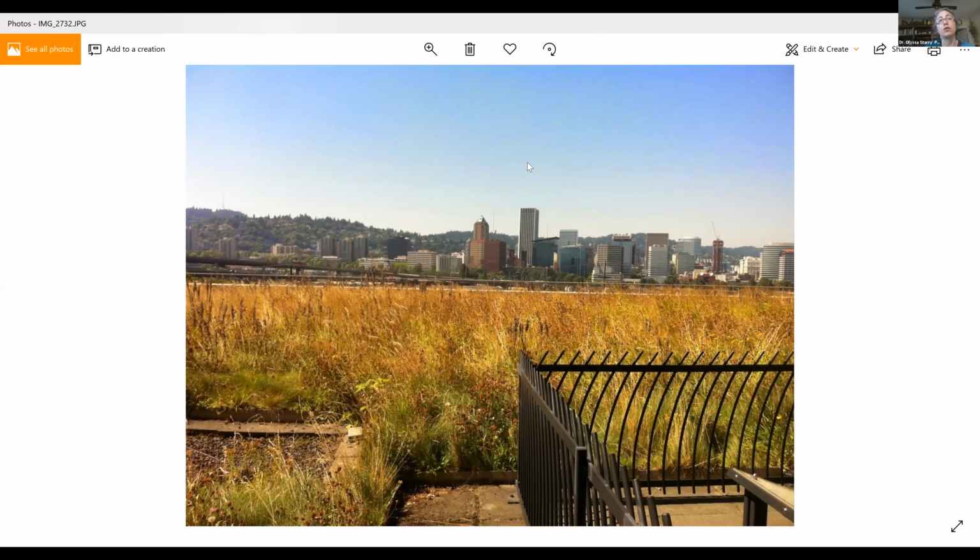They directed me to all of the manuals that are helpful for understanding how to download the data, all of the technical information. And we were able to walk the students through the steps in the manual for collecting data in a research setting, and they were able to do it without any obstacles.